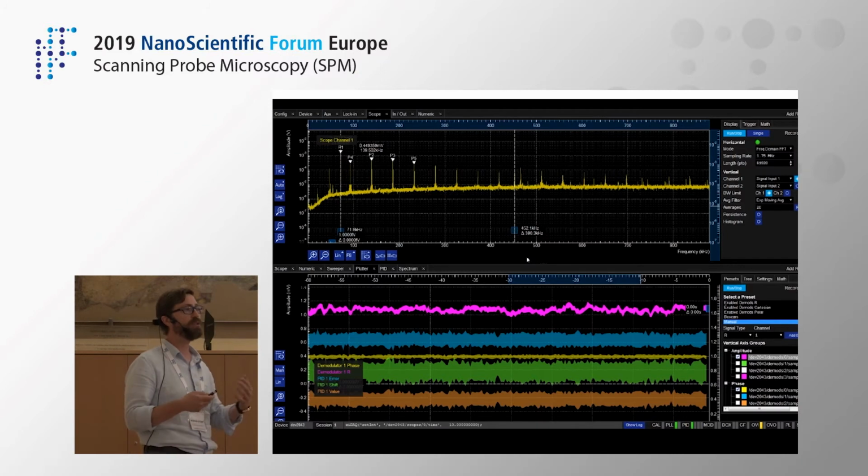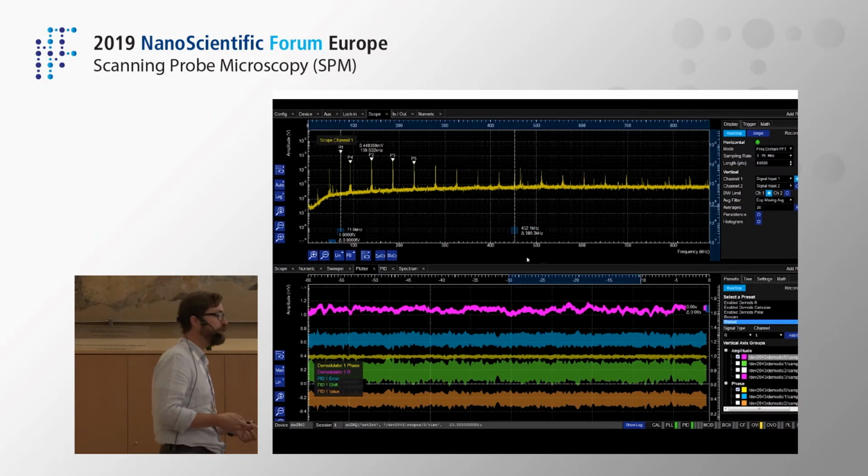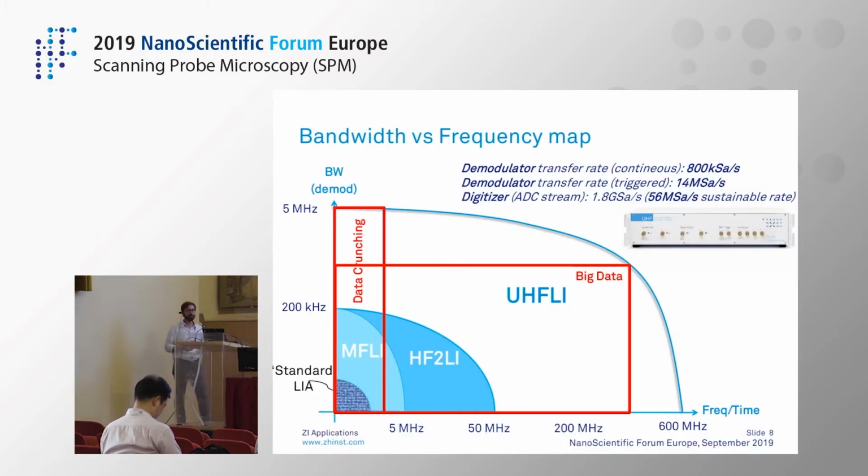We are talking about just a few kilobytes, and that's what makes the real-time images so much easier. Of course, if the frequency itself is changing and you have a fixed frequency, then you may have some variation. So that's why there are many other techniques for this. And actually, when we look at either the full data acquisition or data crunching method, I have plotted this.